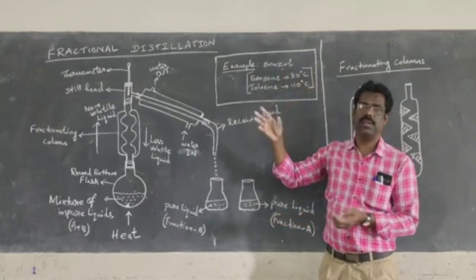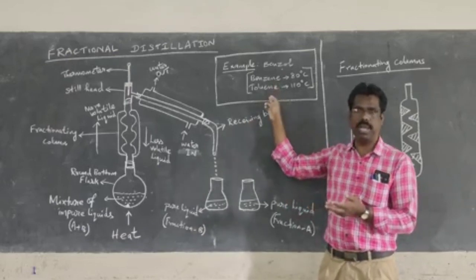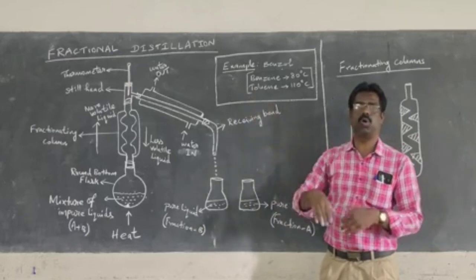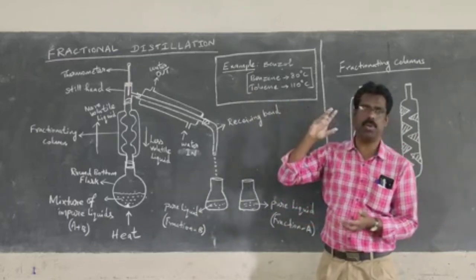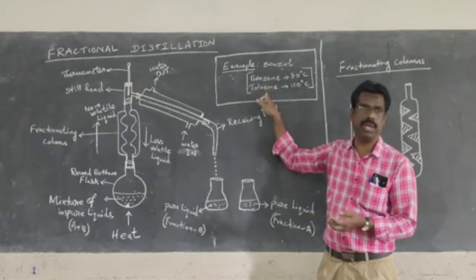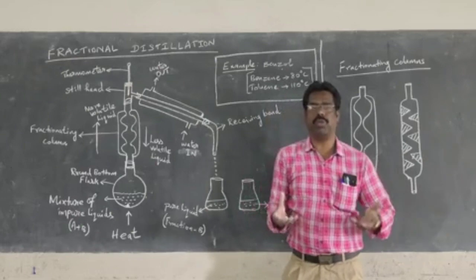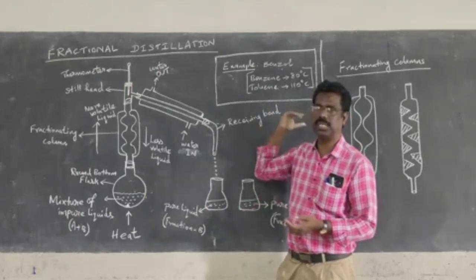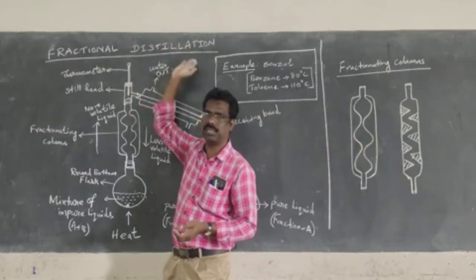Benzol is a liquid which contains a large amount of benzene and toluene along with other impurities. So benzol contains many liquids, and the major components are benzene and toluene. Here, from benzol, we can purify the benzene and toluene separately. Since it is more than one liquid purification, we call it fractional distillation.